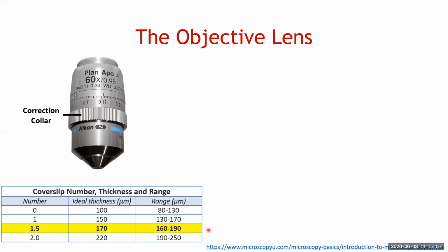You have to realize that especially for the higher numerical aperture lenses, changing your cover slip in either direction will really mess up your imaging, so you have to keep an eye on that. I know a lot of you are in labs where you just have a junk drawer full of cover glass that you grab without thinking. So make sure you keep an eye on that before you end up mounting a bunch of samples and then regretting it.